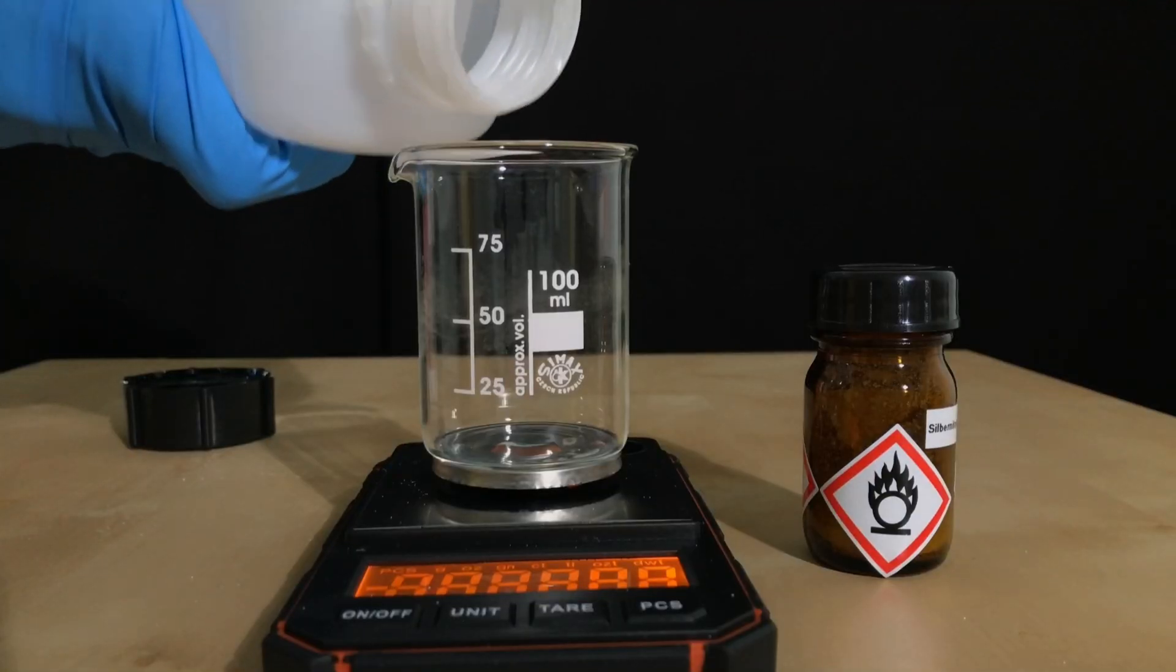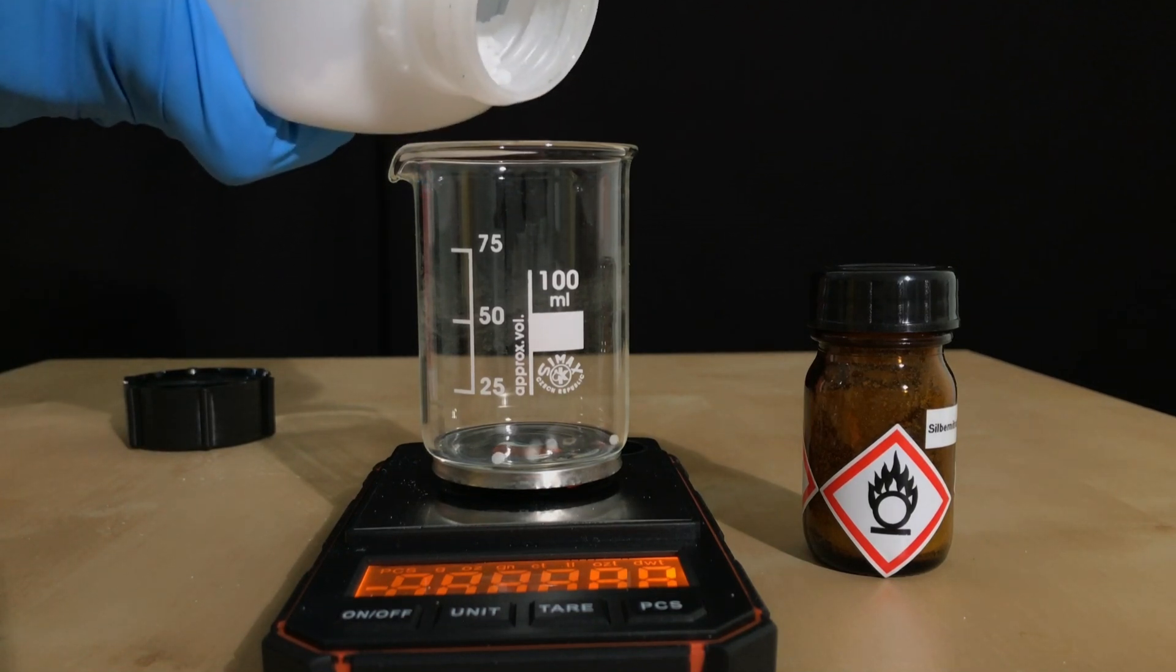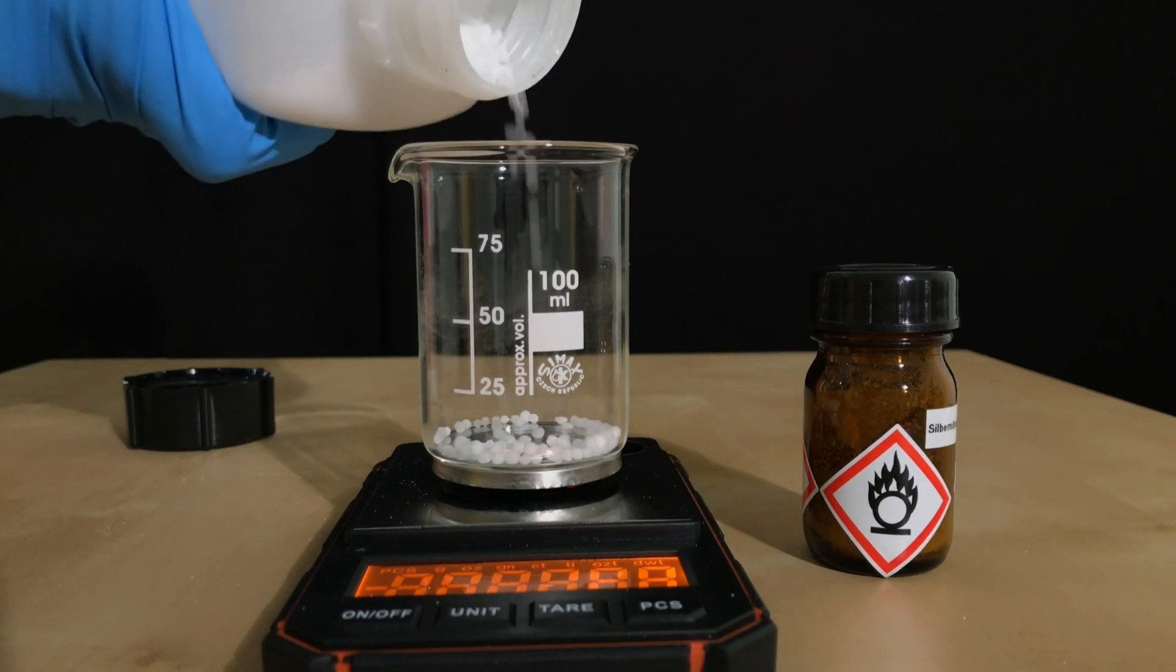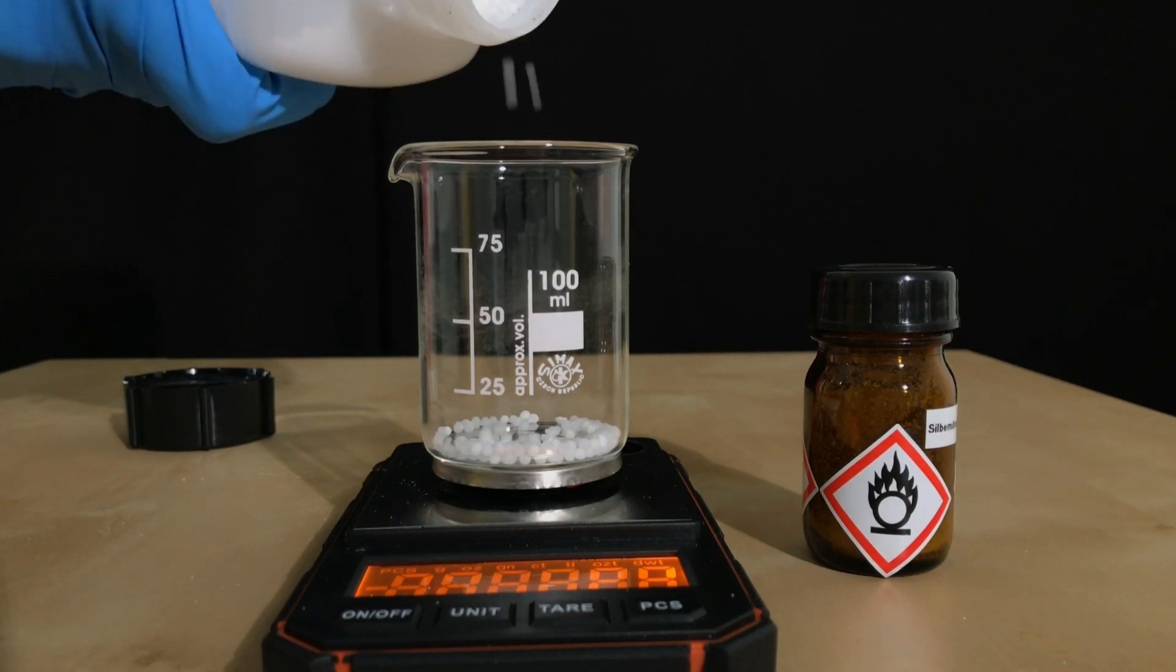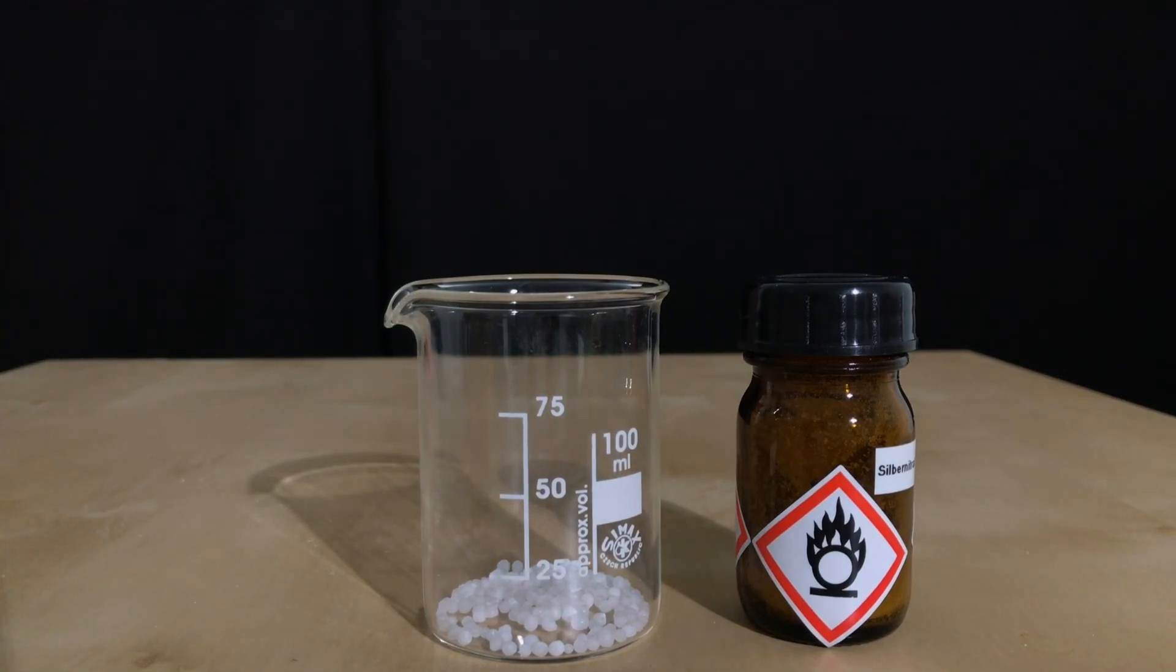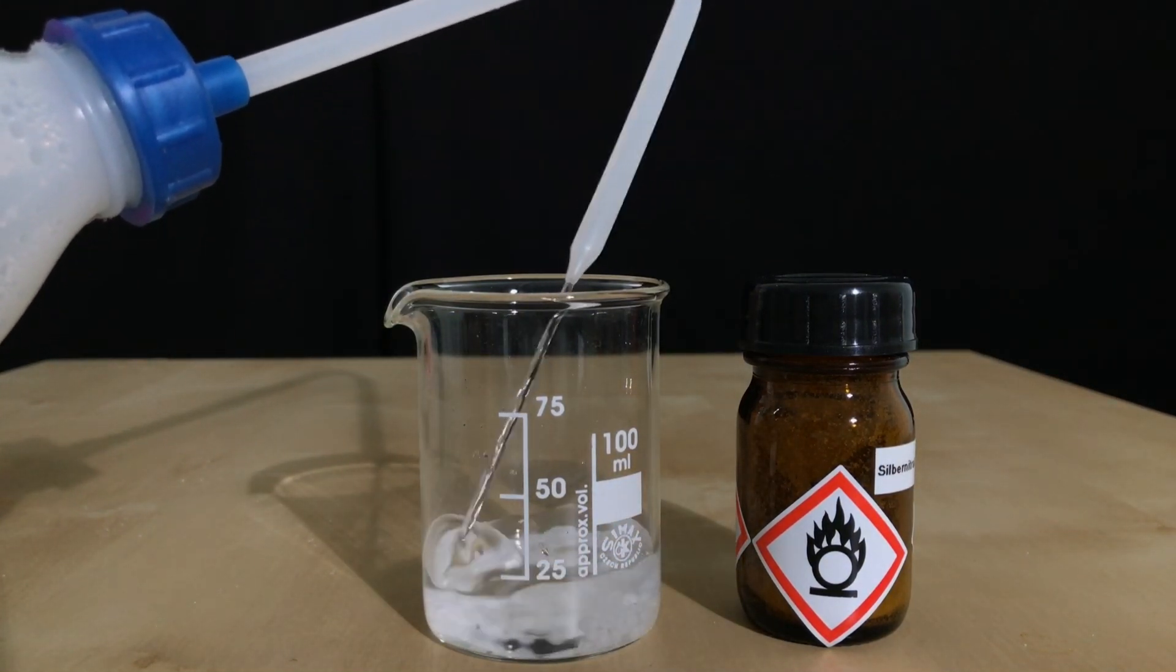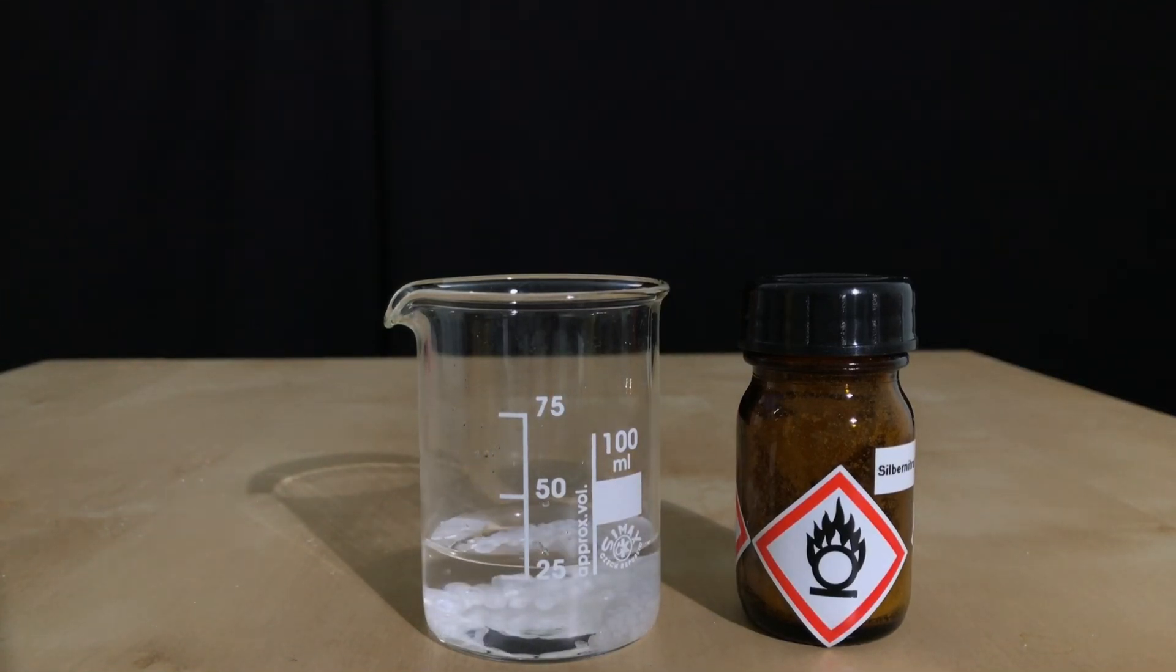The next reagent to be weighed out is sodium hydroxide. We use 3.2 grams of sodium hydroxide, which represents a huge excess, in order to make sure that all of the silver nitrate reacts. I already said it way too many times, but add sodium hydroxide to water and not the other way around. I still added water to the sodium hydroxide and then swirled around the beaker.